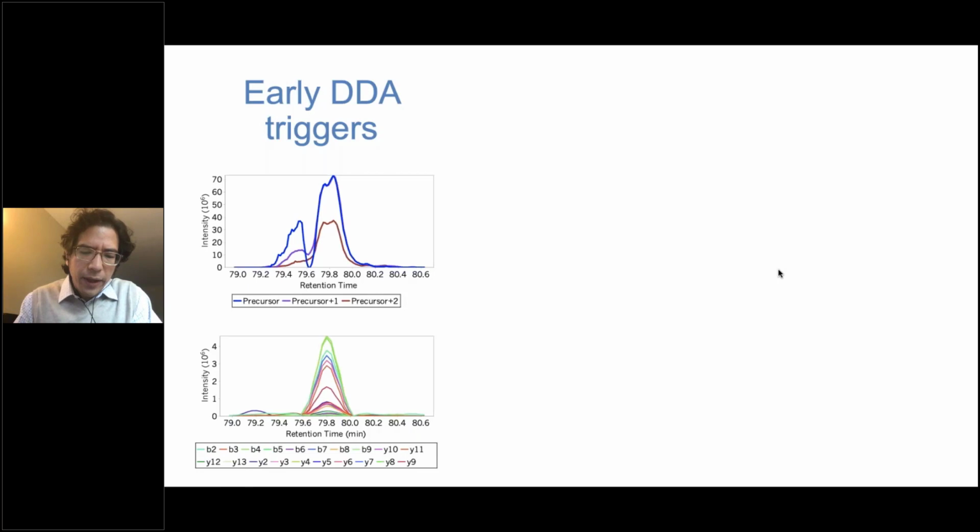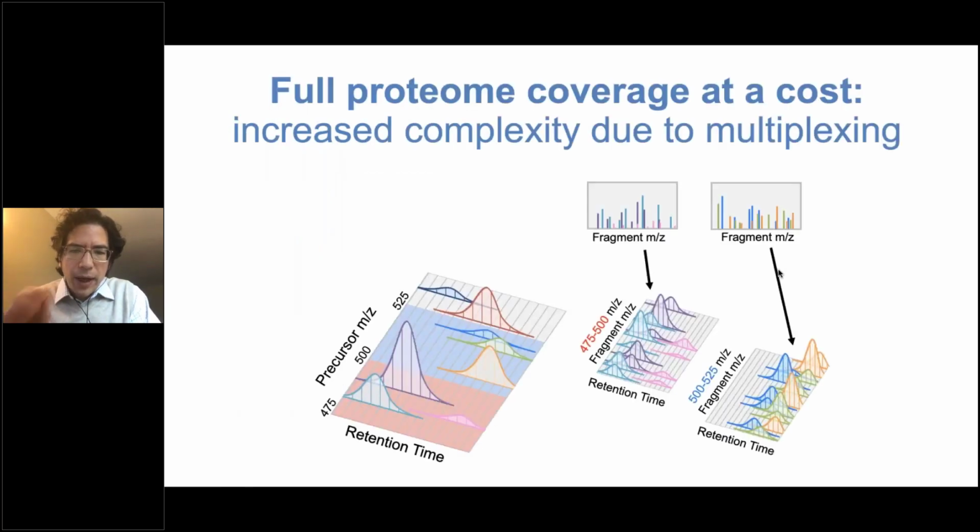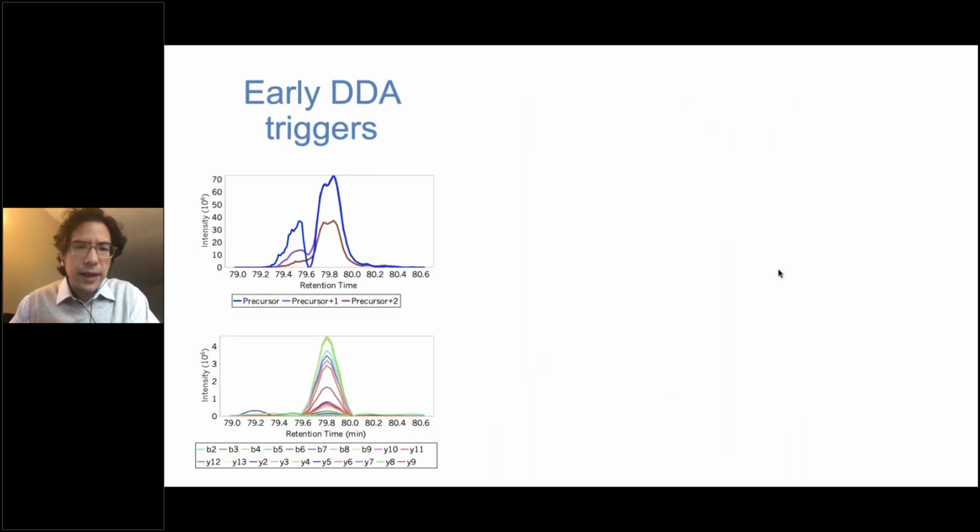So given that, there's a lot of interest in why DIA is so useful and why people are interested in it. I think that it gets around a lot of the concerns of doing DDA analysis. Max touched on some of these a little bit, but I just wanted to stress what these are and where they come from.